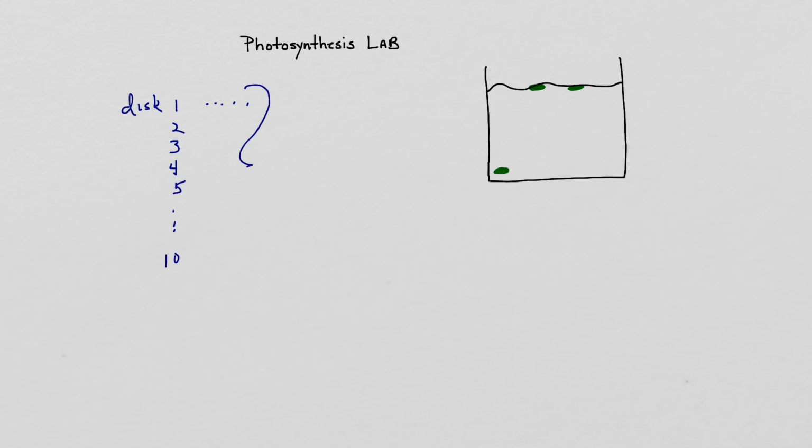We're going to convert this data table, where we have a time for every disk, into one where we have frequencies. What I mean by that is, we're going to make a new data table. And in that data table, we're going to look at exactly how many of these disks rose in a time period. So if we look at 0, 1, 2, 3, 4, and we'll stop at 5. What this represents, the 1 minute mark, would mean any disks that rose from 0 to 1. So if there was a disk that rose at 32 seconds or 59 seconds, we would count that as one disk.